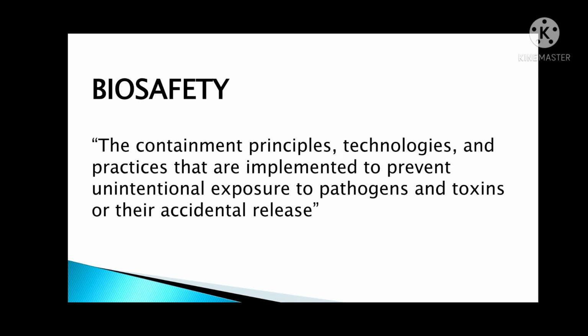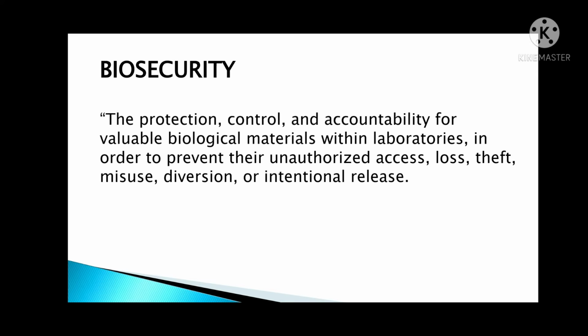The main objective of containment is to confine all these biohazards and to reduce the potential exposure of the laboratory worker, that includes you, the persons outside of the laboratory, that may be your family or your friends, and the environment where you live, to potentially infectious agents.